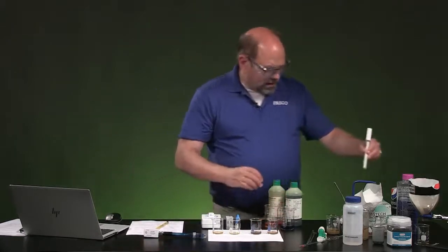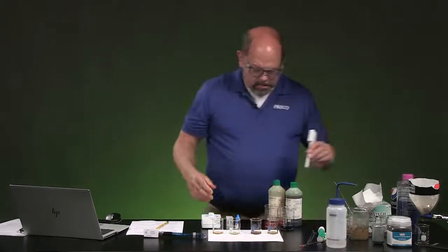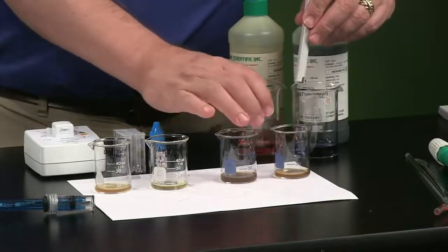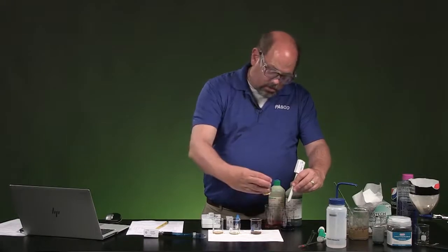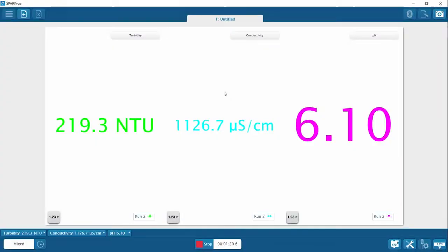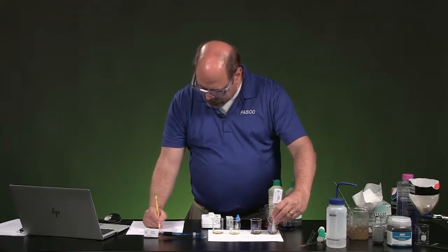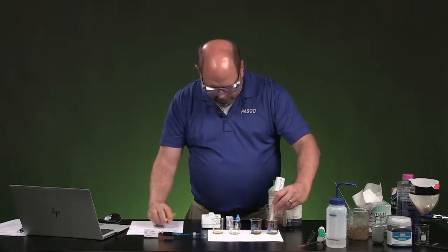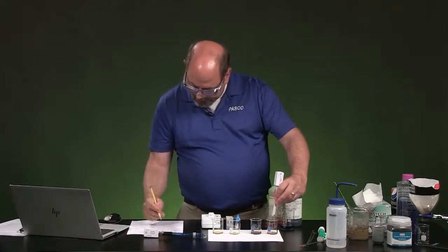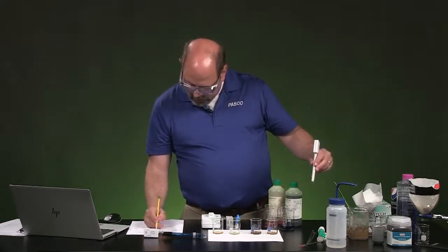Okay. It's important to realize that on a scale of 1,000, if you're down 10 or 12, that's not a lot. The last one is the one that had the sedimentation. We just allowed the sediment to settle. So we'll see if it matches that first one very well. Okay, and that is coming out at 1130. Again, very similar to some of these others. That's sedimentation, 1130. And I forgot what it was. Oh, I just wrote it in the wrong column. 1197.